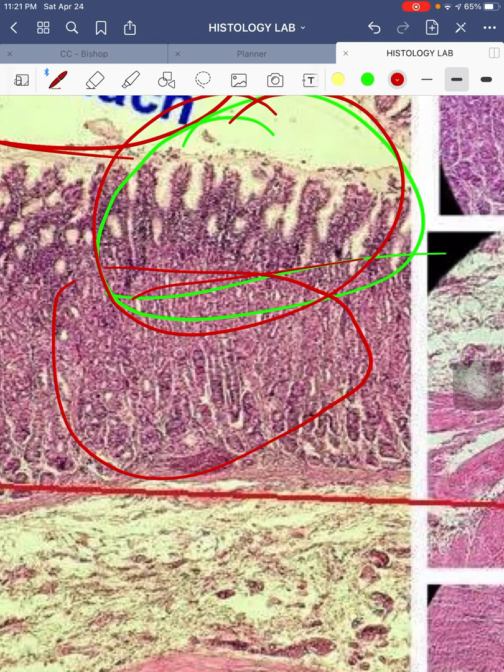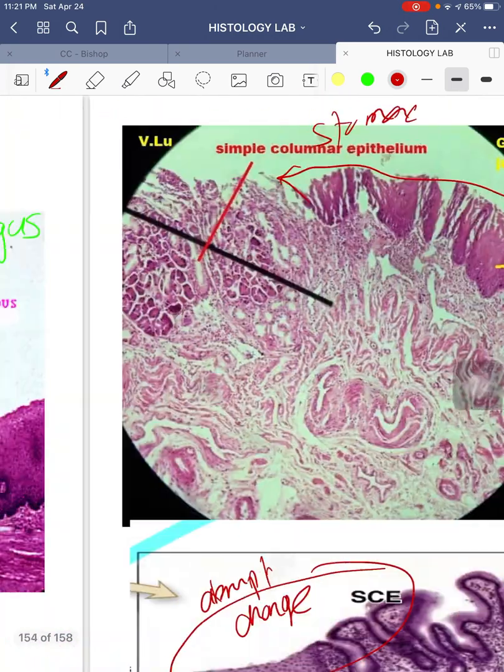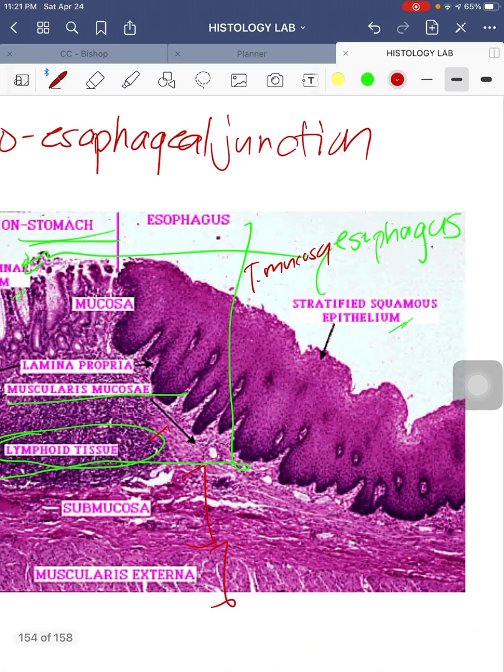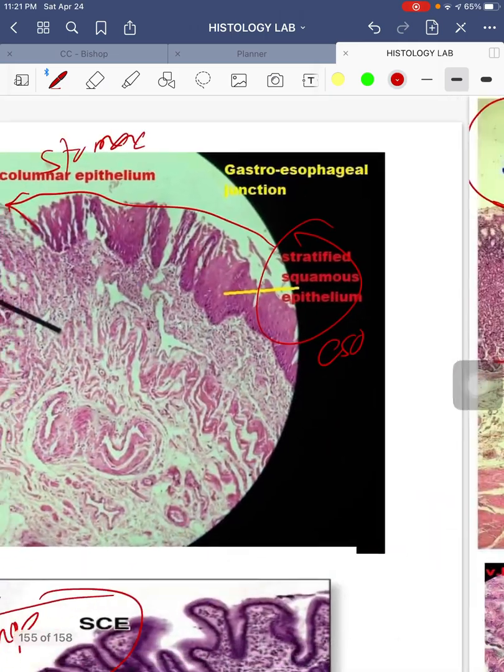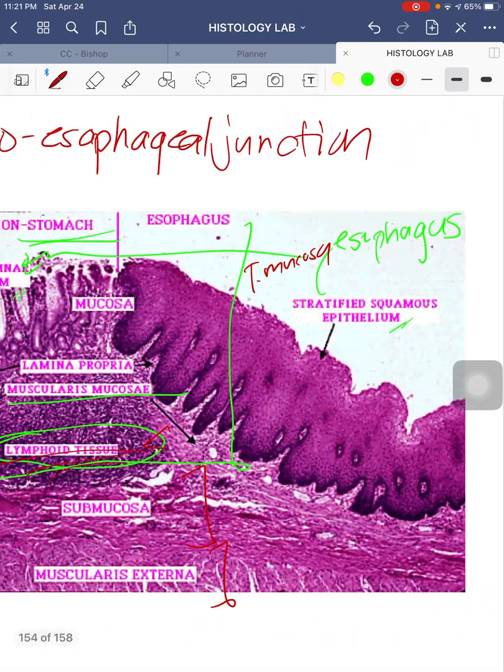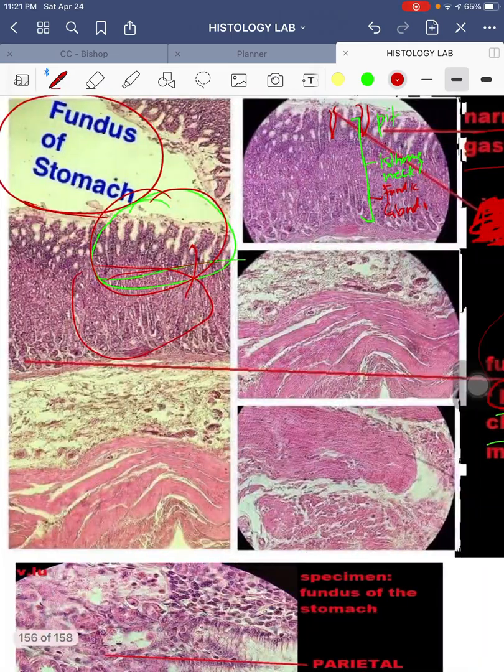And then they will extend to several tubular glands. So again, also the lamina propria is the vascularized area that supports your gastric pits. Okay? They may contain smooth muscle fibers, lymphoid cells, capillaries, and lymphatics. That's why you saw earlier that this area here in the stomach region also had a lymphoid nodule. Okay, so that was in the lamina propria of your stomach region already.